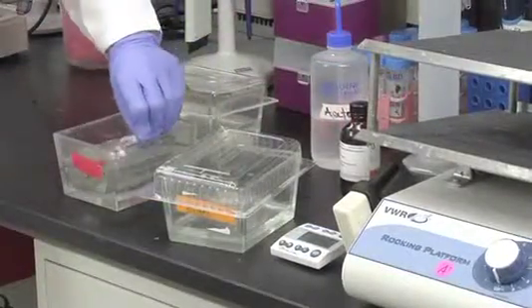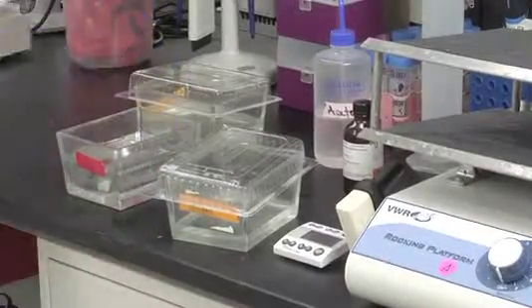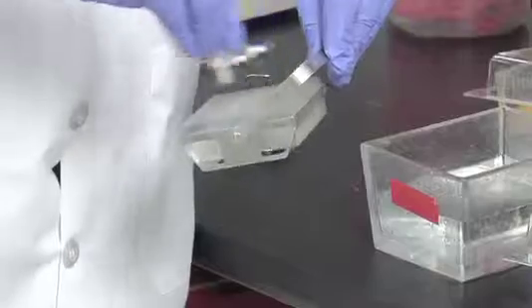After completion of the acetone rinse, slides are rinsed in Milli-Q water four times to remove acetone and then dried using filtered compressed air.